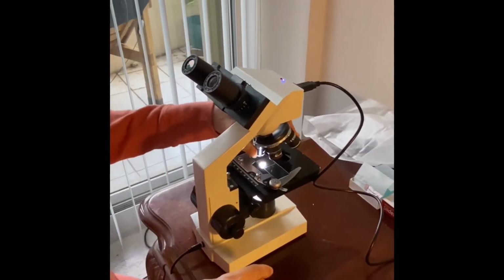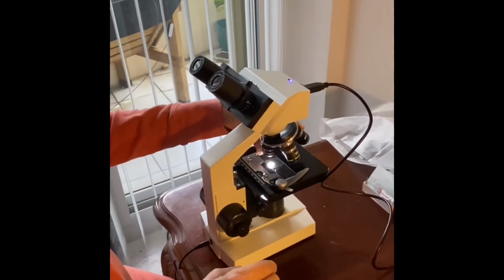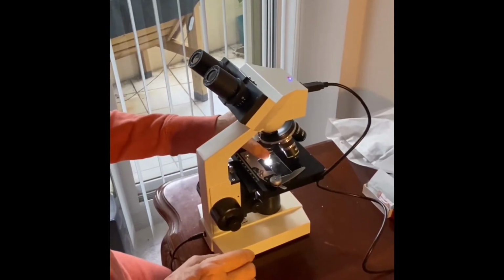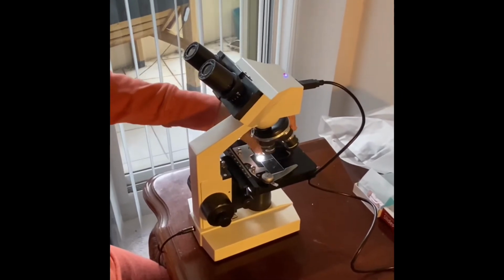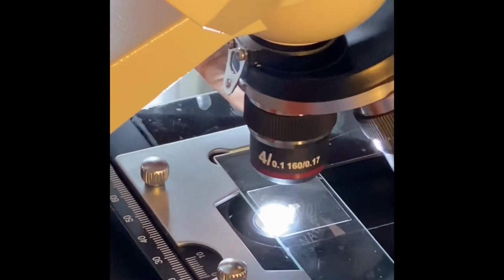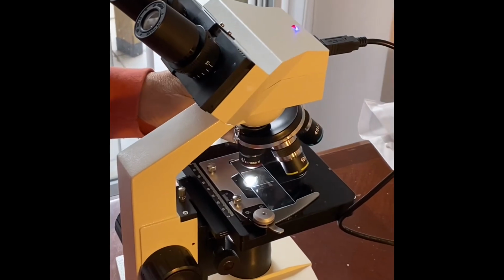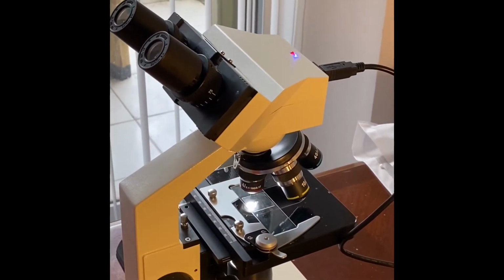As you turn the nose piece, you can hear a little click in it. That's how you know it's set in properly, and it's not like this, where the light will not be able to travel through. Okay, so we just went over the objectives.